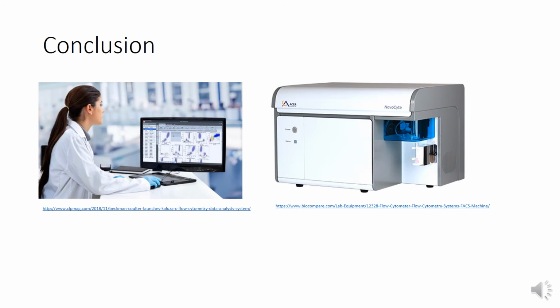So in conclusion, from their work, this group developed a virtual core cytometer that could achieve similar results to a traditional cytometer without the need for supplying a large quantity of sheath fluid. It is also less complex and allows for greater use in field laboratories in those areas in which traditional cytometer is unrealistic to use. One example they discussed from the paper was that it can be used to measure phytoplankton populations from ships, whereas the use of traditional cytometers would not allow this to be done.